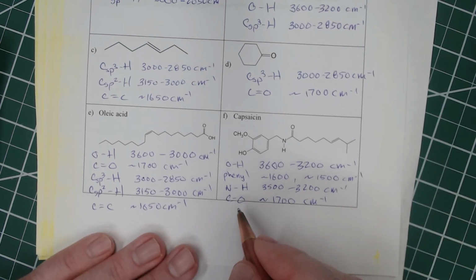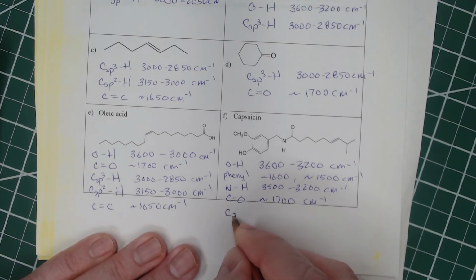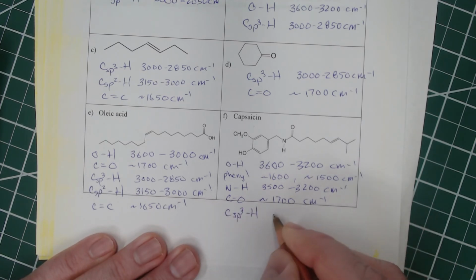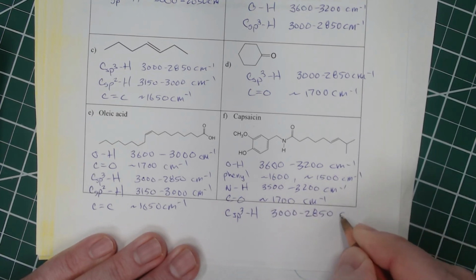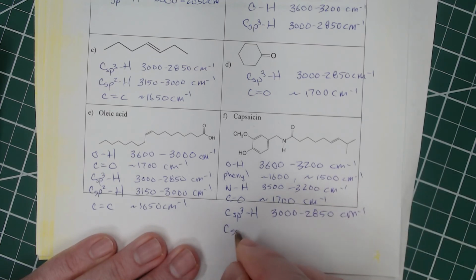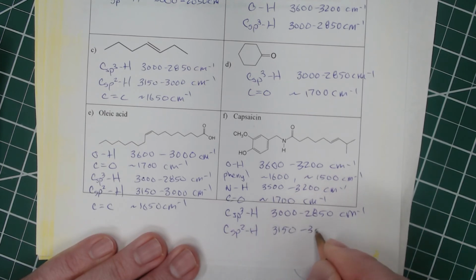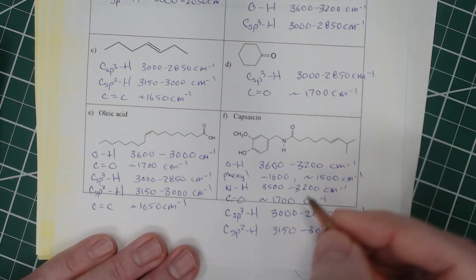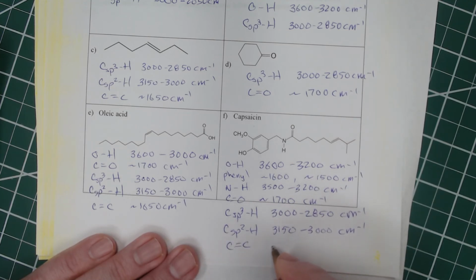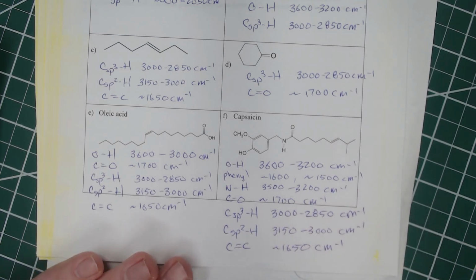All right, and then we haven't even done the carbon hydrogen, so carbon sp3 hydrogen, which should be 3,000 to 2,850. Carbon sp2 hydrogen from 3,150 to 3,000. And then for the last thing, we've got this carbon-carbon double bond at about 1,650 reciprocal centimeters.